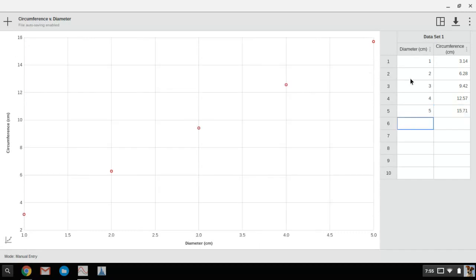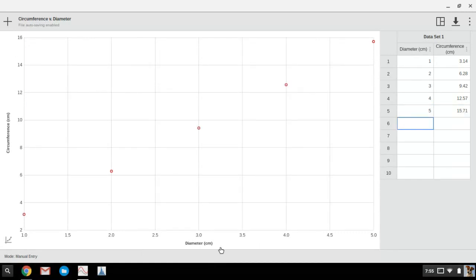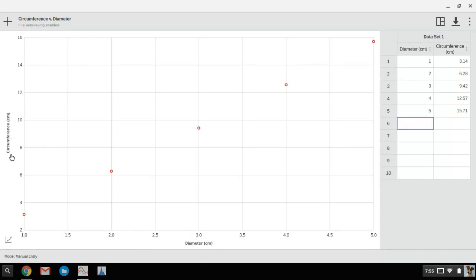Okay, and so there's my graph. I've got my X and Y axes labeled with the quantity and the units because I put that into my data table correctly, and I've got my points plotted. The only thing that I'm missing to complete just the graph itself is the title.